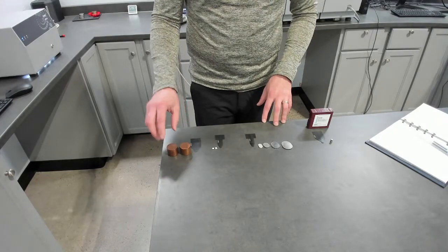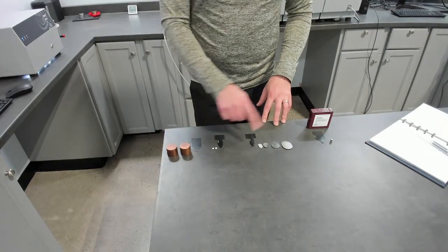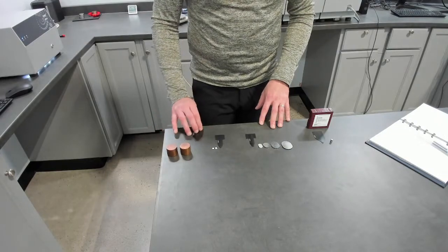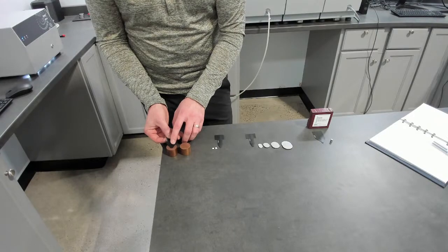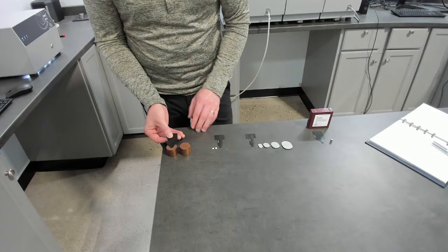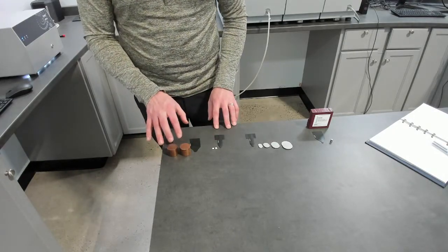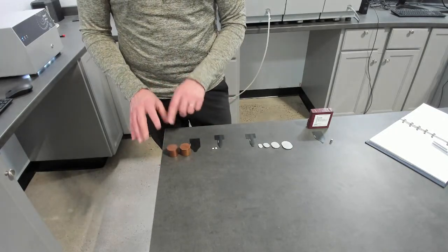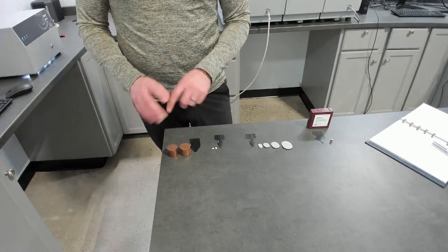So even though these are large in size, because they have a very high diffusivity, and we do have various sensor sizes which give you different ranges of penetration depth. Penetration depth is described as the distance from the edge of the sensor to the edge of the sample when it's centered. So it's very critical to be able to measure 0.25 seconds to keep the heat within the boundaries of the sample, which is critical to the basic theory of transient plane source, that the sample is a semi-infinite body.